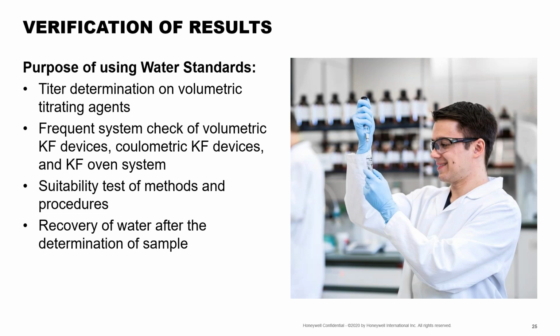So, water standards, you can get either 1% water, 5% water, 0.1% water, so really tailored to close to the actual sample size that you're using. And as you can imagine, you can inject a much larger sample size, which you can do much more repeatedly than using pure water itself, where we're talking about not even milligrams of sample, even micrograms of sample that we're trying to inject.